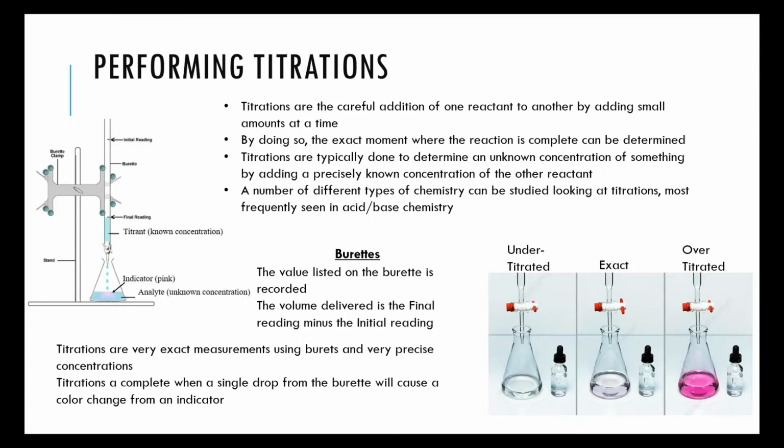Nothing has been removed from the burette. Nothing was delivered to that flask below it. And as you're draining solution and it's reacting with the solution in the flask, the volume in the burette is lowering, but the number is increasing. The numbers are read down.